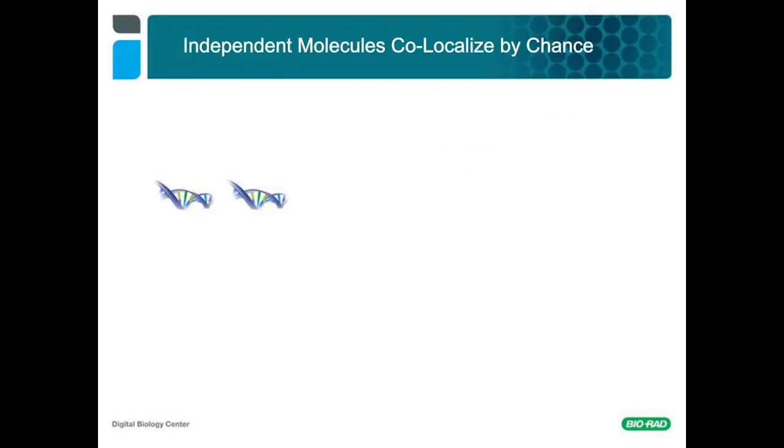In the next few slides, I will cover the principle behind using ddPCR to determine whether variants are cis or trans configured. Here, I show two independent DNA molecules. In this presentation, I will represent DNA molecules as straight horizontal lines and depict the targets of interest with vertical lines, accompanied by lower and/or uppercase letters to indicate whether the targets are variants or wild-type sequence, respectively. Here, I show two variants.